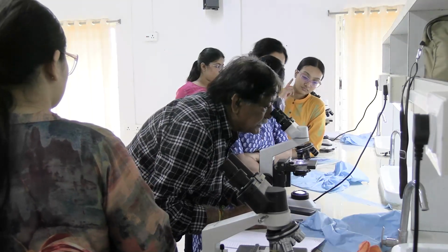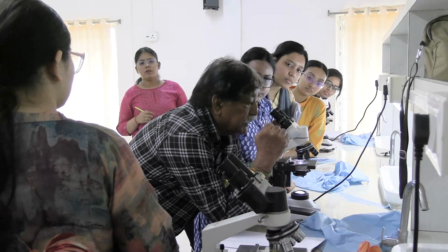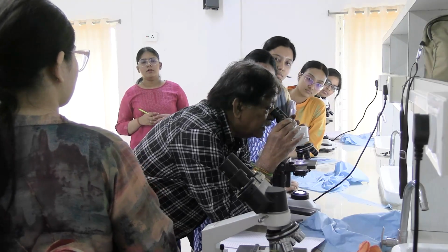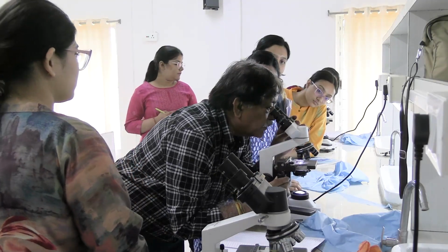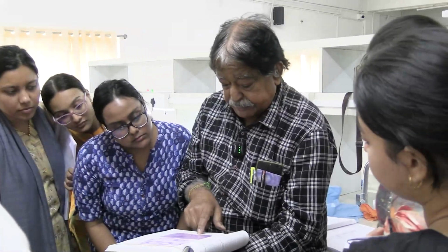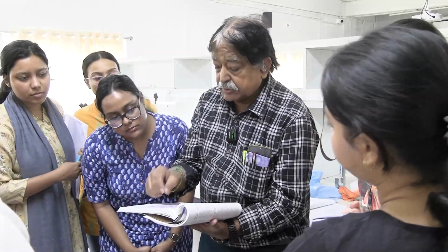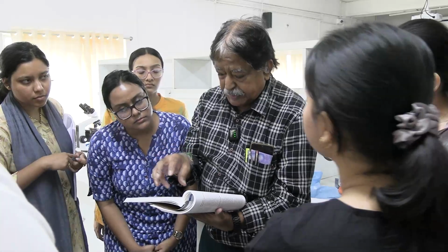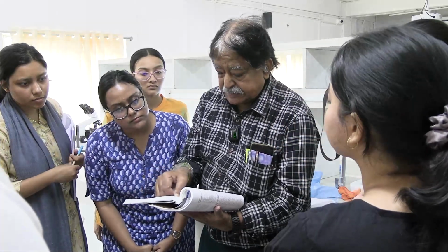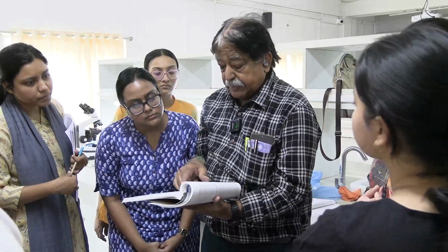Now you see like this. You put your hands like this to rest, and because of a single movement, you operate the optics. Hand drawn picture, spleen as seen in the drawing. This is the hand drawn picture from the histology textbook. You draw a small piece like this size, and to some extent, but don't do a very artistic drawing.